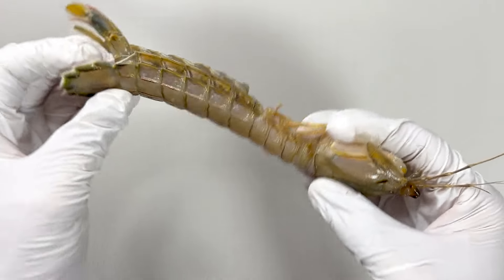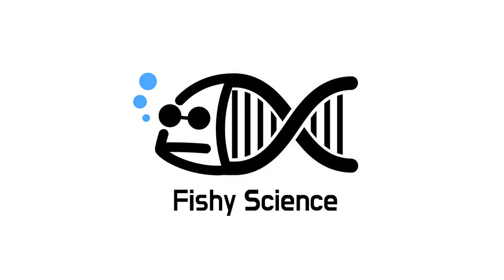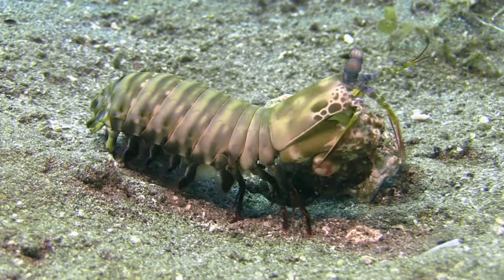What kind of creature is a mantis shrimp? Today, let's dissect a mantis shrimp.